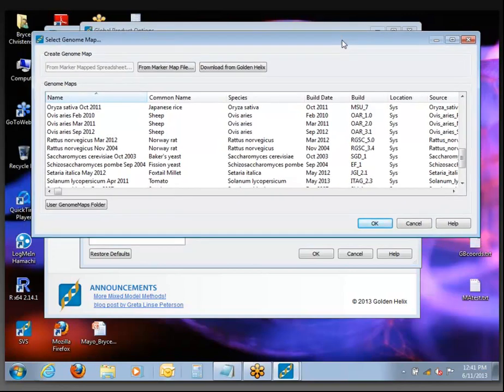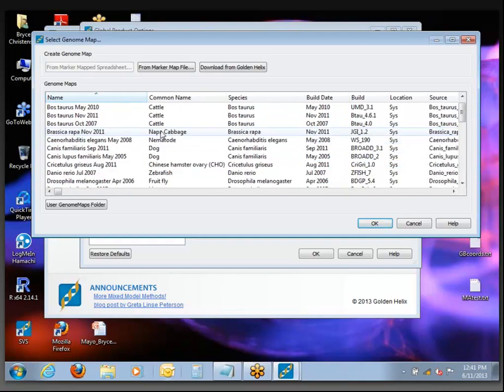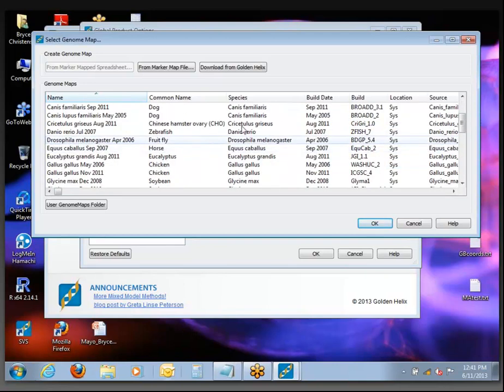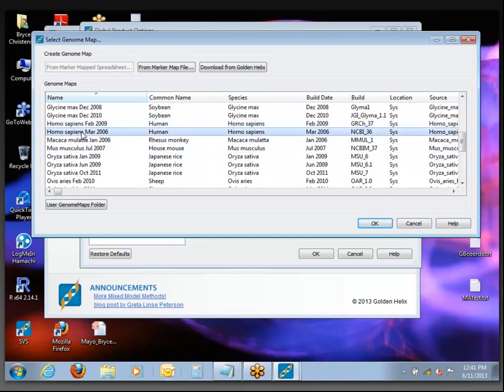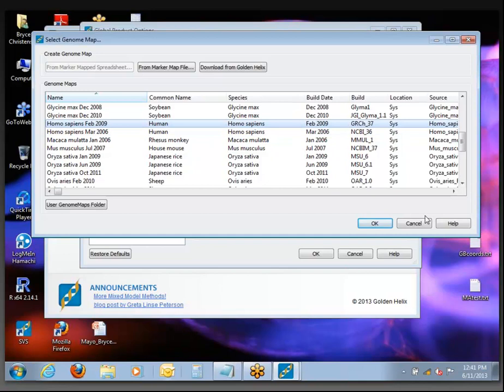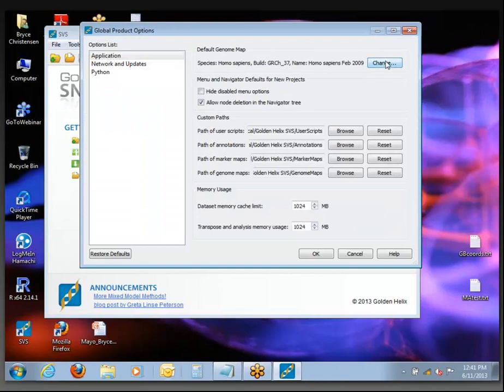It does also determine which annotation tracks are visible to you by default. In the data sets we're looking at today, one of them will actually be based on NCBI 36 — the older human build. That's what we'll be working with in our first demo data set, and then with the second one we'll be in the newer GRCh37. You can also change the genome build at a per-project level, but whatever species and genome build you're working with most is usually helpful to set as your default genome map.